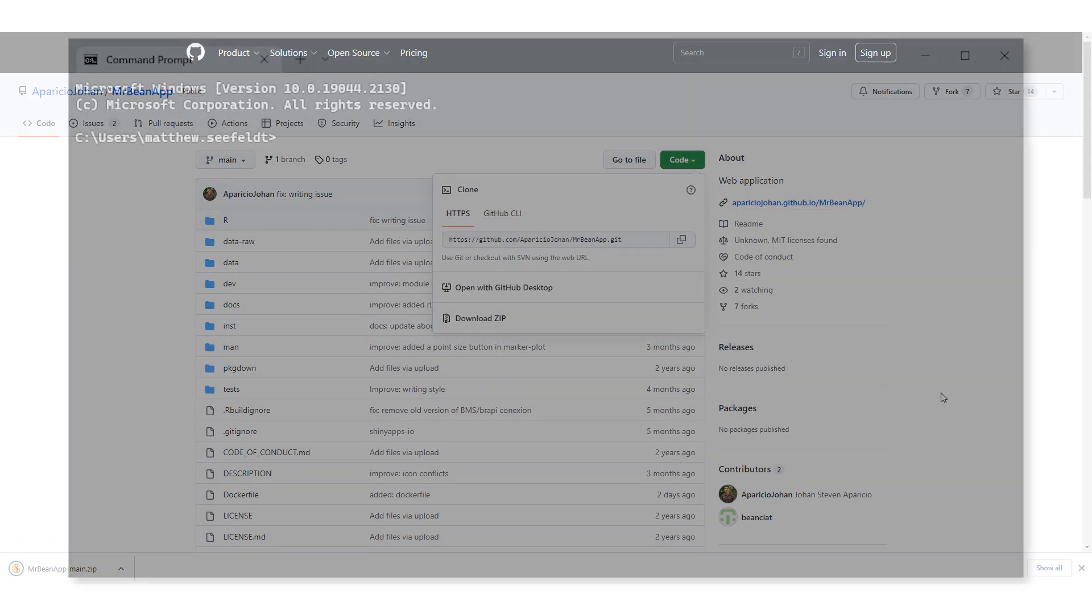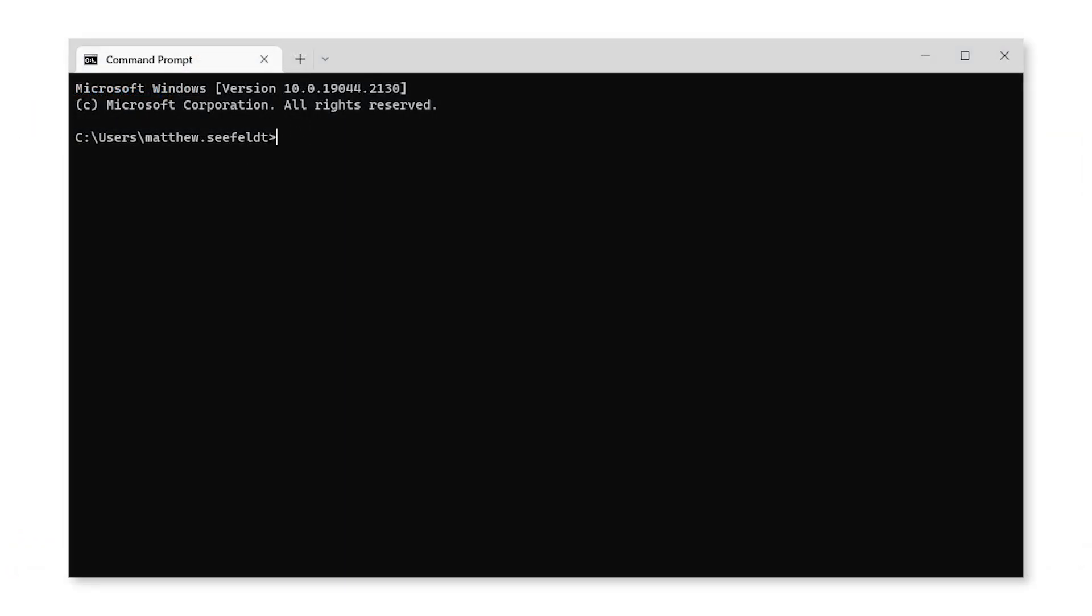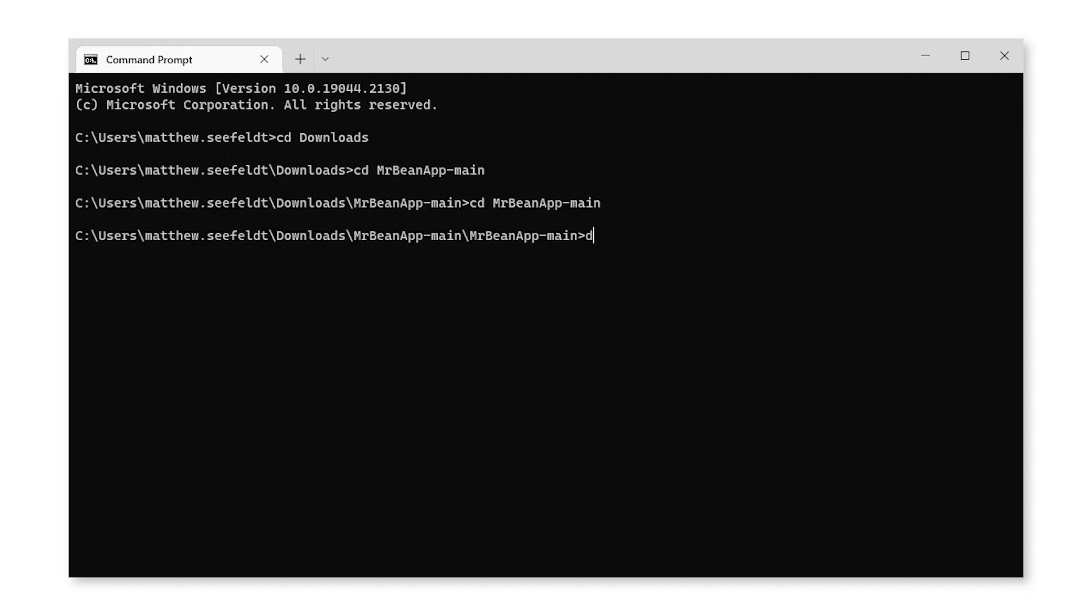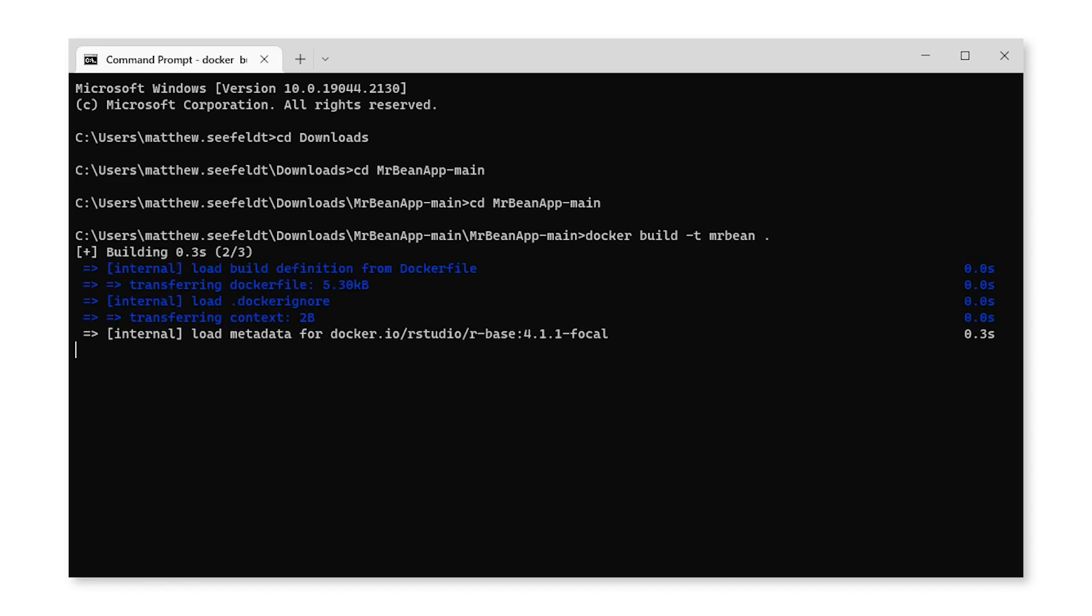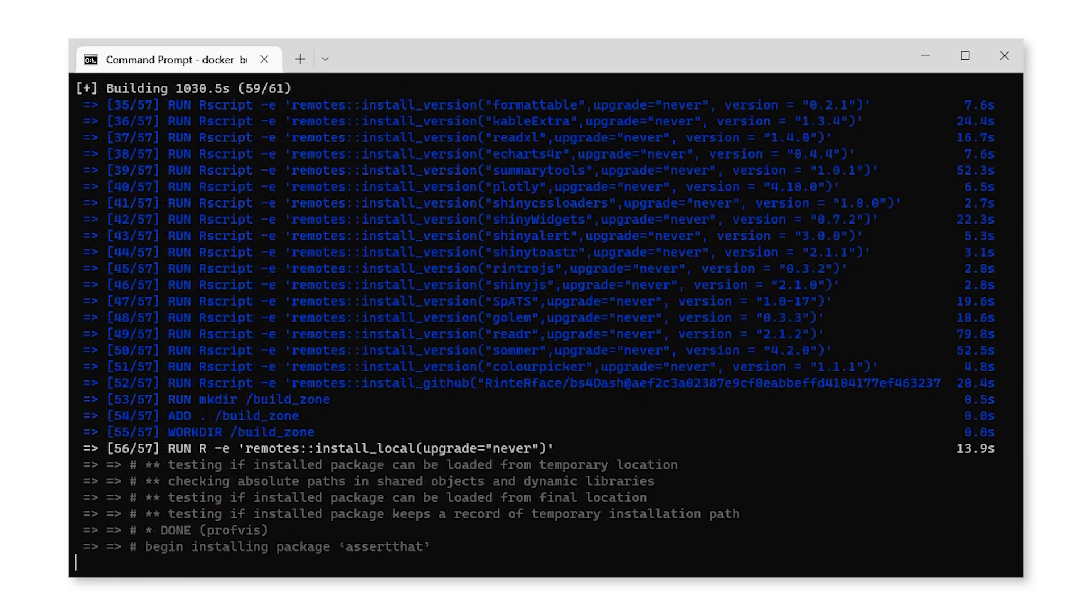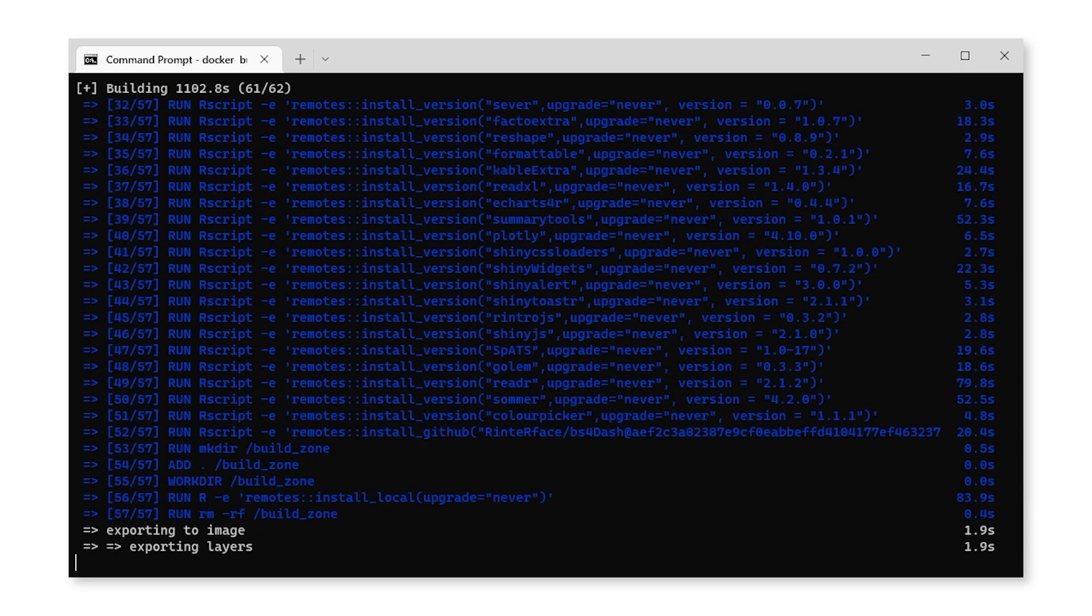Next, open a terminal and change directory to the folder containing the repository you just unzipped. Enter the command docker build dash t mrBean dot to build a Docker image from the files in the folder from the repository.